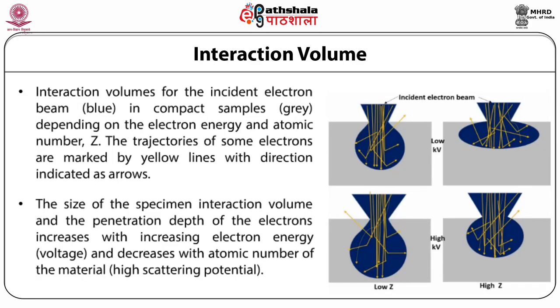Scattering into high angles or even backwards is unlikely in all materials, but the likelihood increases with the atomic number. Furthermore, the beam broadening increases with Z, and the intensity of the direct beam is weakened by the deflection of electrons proceeding in the forward direction. Since the amount of deflected electrons and the weakening of the beam intensity depend strongly on the atomic number, different materials produce differences in the color contrast.